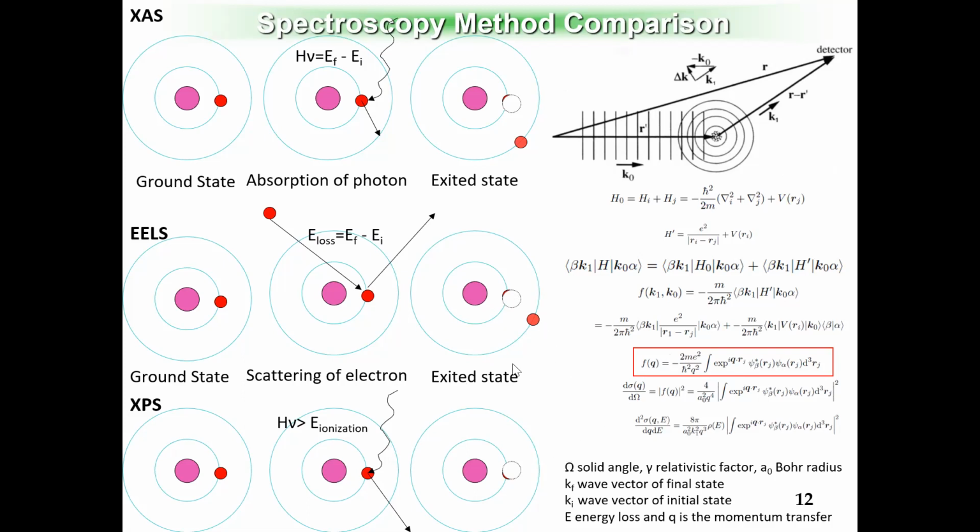That's the major difference compared with XAS and EELS, which still have the discrete energy levels even after the electrons have been excited, right? And those are the mathematical equations I found from that spectroscopy book. I won't go through those equations, but basically the square box here is to simulate the spectrum and then compare with the experimental data, right?